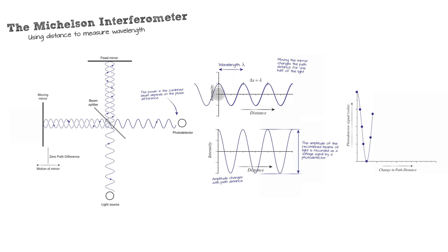Look, there is one beam. That's how much out of phase it is. It's out of phase a whole wavelength before it finally starts lining up with the other beam, because it moved a whole wavelength further. It's a whole wavelength behind. And that's what the interferometer does. Look, we're a whole wavelength behind. The mirror moved, and it changed the path length by a distance equal to a whole wavelength.